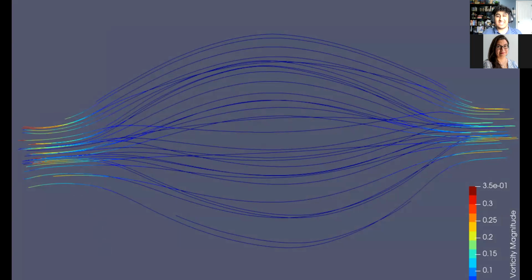And vorticity is basically the speed at which it rolls around. And in this diagram, where it's more red, it has increased vorticity. And where it's more blue, it has decreased vorticity. And you can see that only in the beginning do you see these slight hints of red, or high vorticity. And in the center, it's very blue and has low vorticity. And it's exactly what we want. We don't want these vascular cells in the middle, which are attached to the membrane in the middle chamber, to be damaged by this media flow of vorticity.